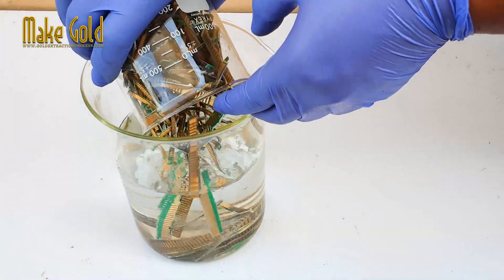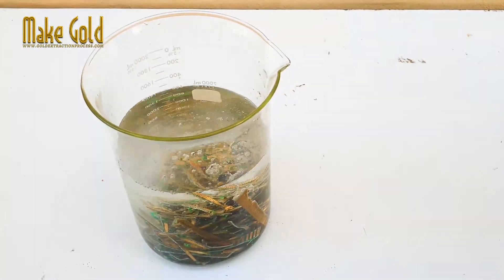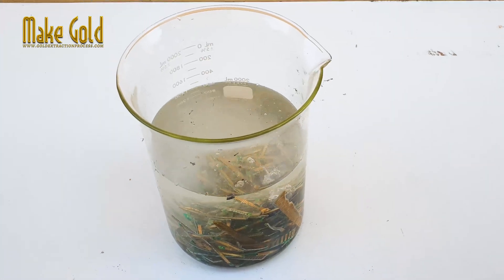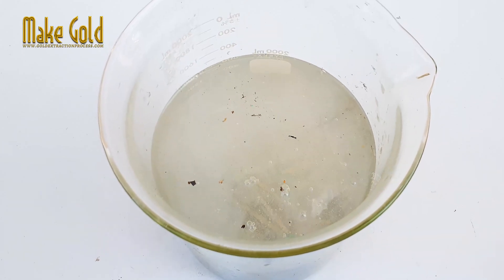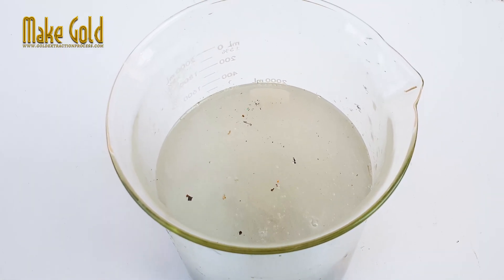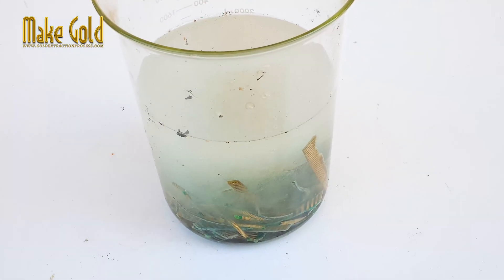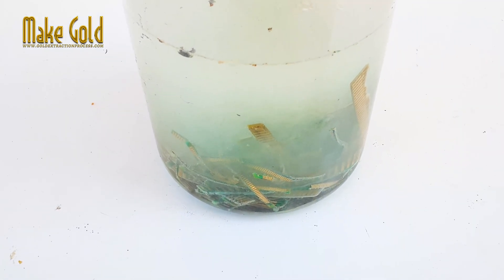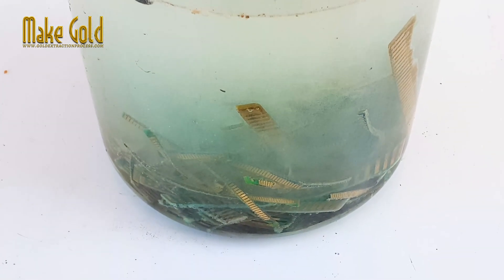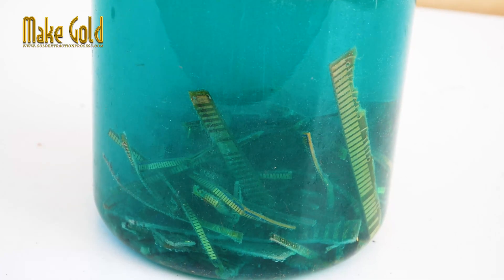Allow the nitric acid to separate the gold from the PCB. This process can take 15 to 30 minutes.